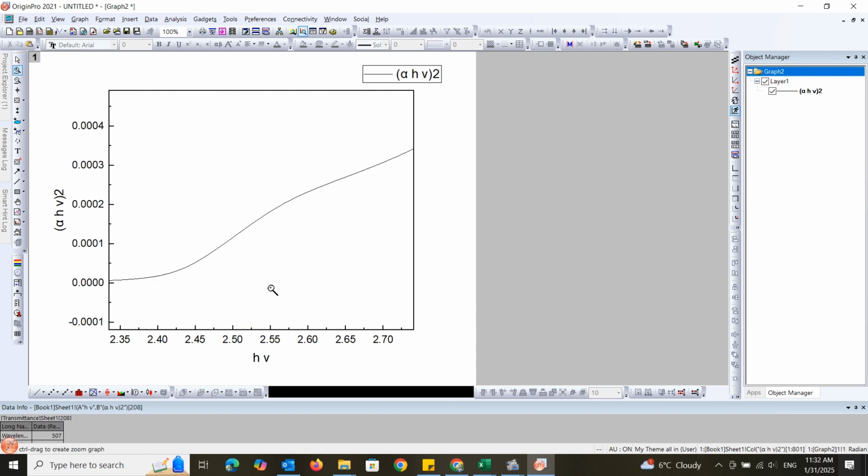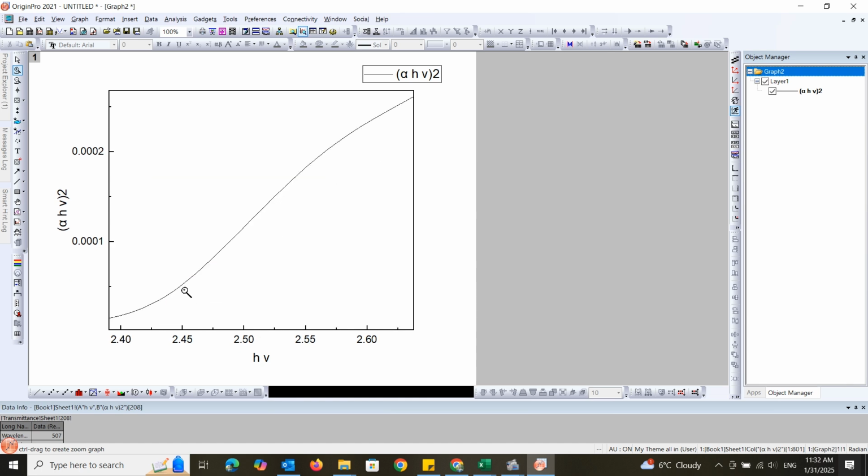The trick I used for this was the limitation of the software in making perfect curvatures in this S-shaped region. Check carefully these two straight lines. I need to choose data points between those lines for the linear fitting. Still, there are many data points in that region, so I'll zoom in on the region a bit.